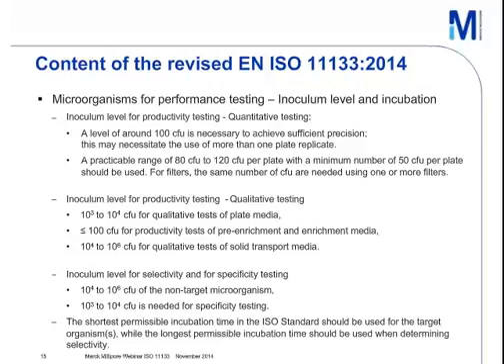For filters, which may have a smaller diameter, the same number of CFU, the colony forming units, is needed, using one or maybe more filters, 1 or 2 or 3 filters.